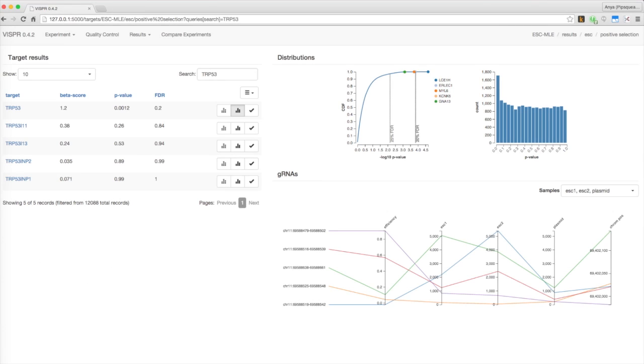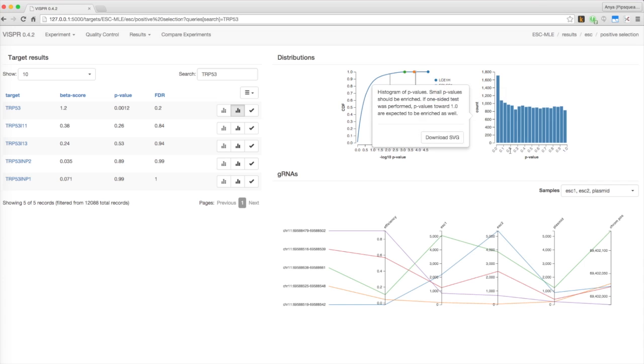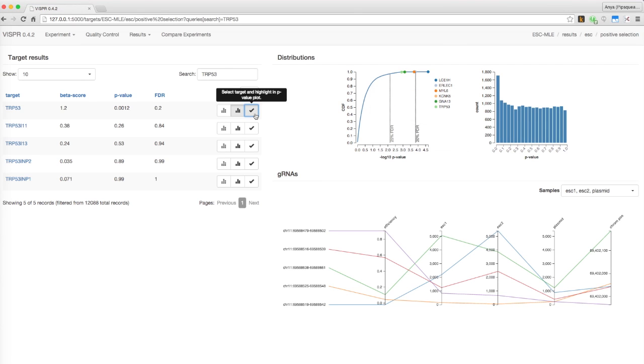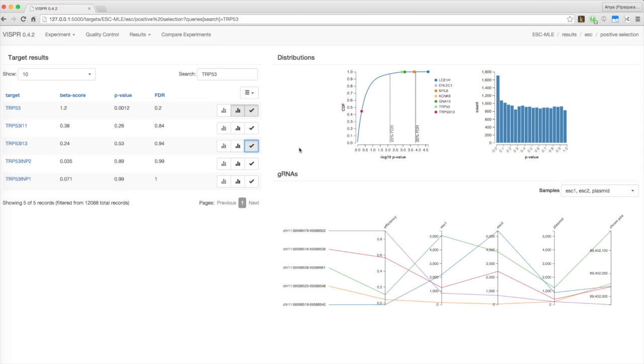On the top right, Visper provides the distribution of p-values as a cumulative distribution function and as a histogram. You can click on the rightmost button beside each target to see where it falls on the function.